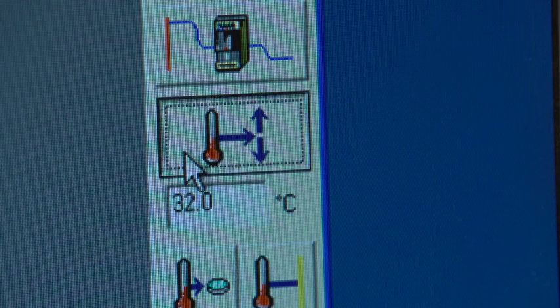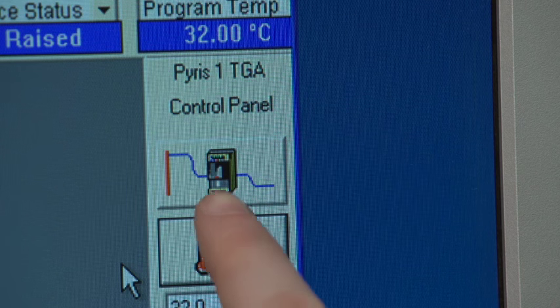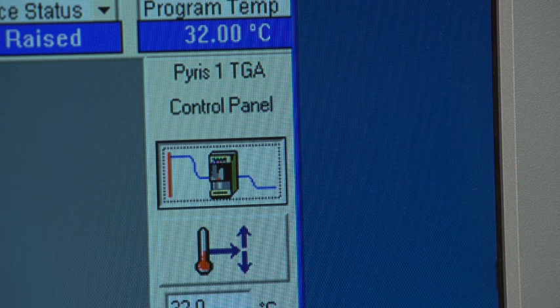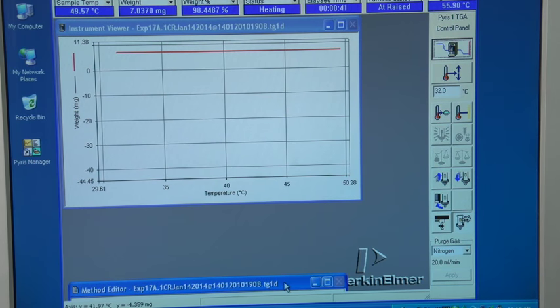Press the Go to Temperature button to reach the preset temperature. In this case, it is 32 degrees Celsius. When the temperature has been reached, press the Start button. Move the cursor away from the button so that you do not accidentally click the mouse and stop the experiment. Slide the method page down so that you can see the progress of your run.